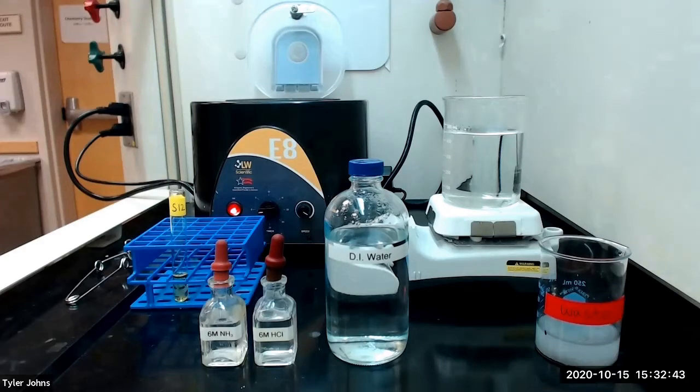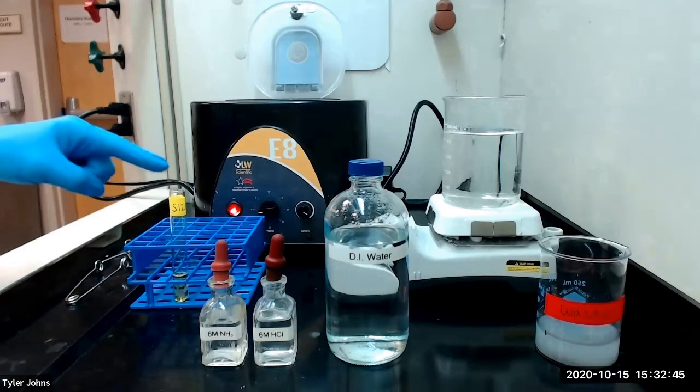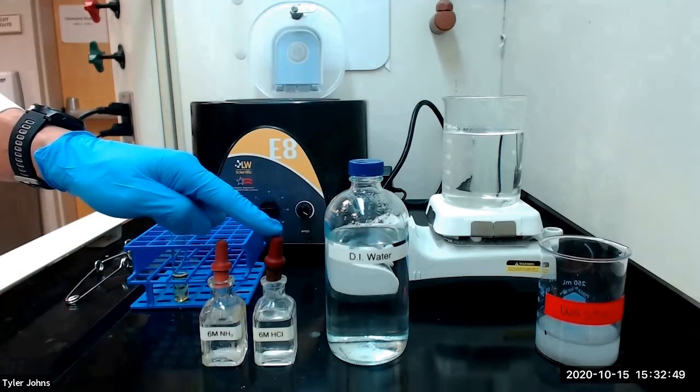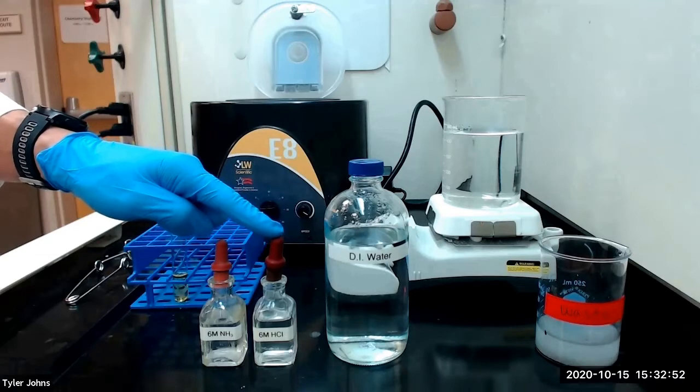We will now perform the test for aluminum ion. We will acidify solution S12 with the addition of six molar hydrochloric acid and add five drops in excess.